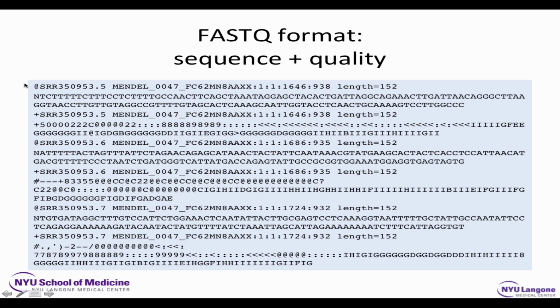So in any case, there's some Ns, then there's some bases. Then the header line repeats. In a lot of the more recent FASTQ files, they don't bother repeating the header line. They just include this little plus symbol and a carriage return. Then comes a quality string that seems to be typed in gibberish. That gibberish is known as ASCII characters.